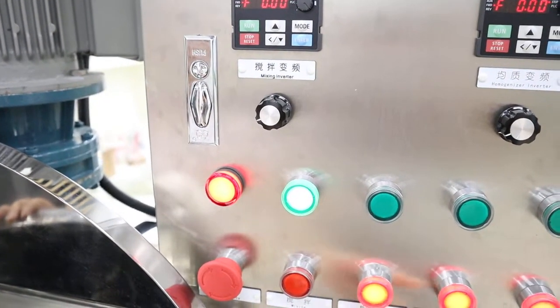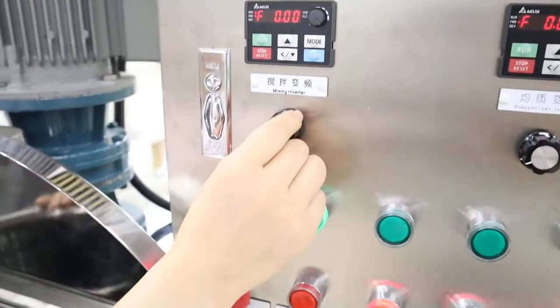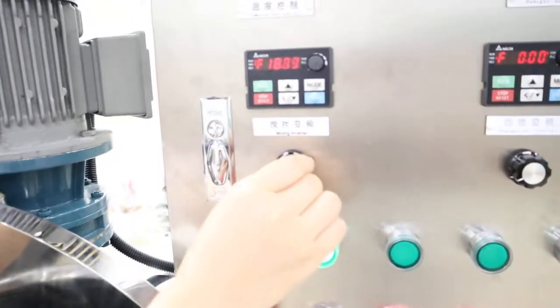This button is for stop. Now open it and we change the speed from here. Inside mixing, the speed can be changed faster.